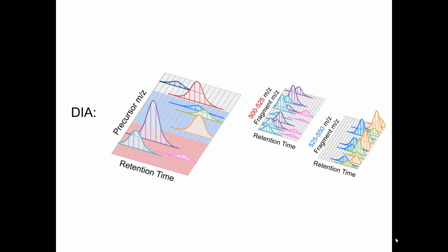There are 3 peptides in this region, and you would see the blue peptide and then the purple peptide and the pink peptide. And then this blue region here would show these 3 peptides instead. And this data obviously is a lot more complex. The MS2s that you get out of these types of experiments are very difficult to interpret manually. And it's very much up to the software to figure out that these particular signals actually correlate with each other and not with a different peptide. Okay?